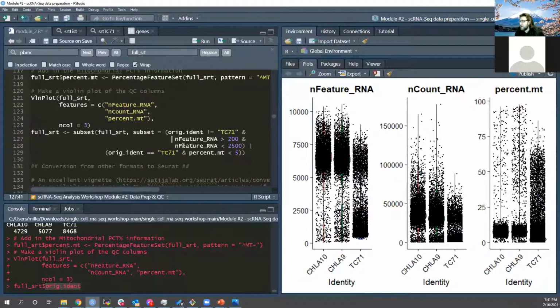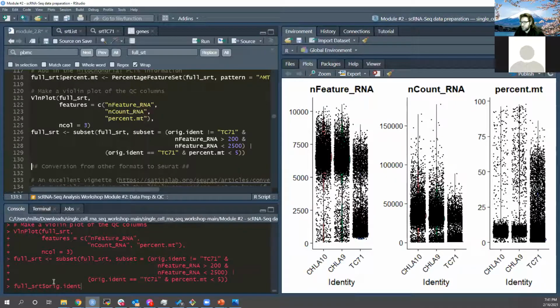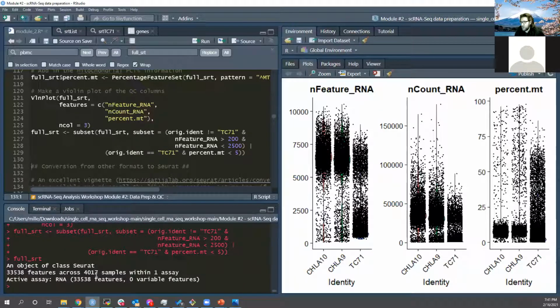That's what we said. So that would be how you could do a subset where you incorporate the information about which cell type it is. Okay, I think that would work. Yeah, that seems to have worked just fine. That probably really reduced my data set. Yeah, by a lot. So yeah. All right.